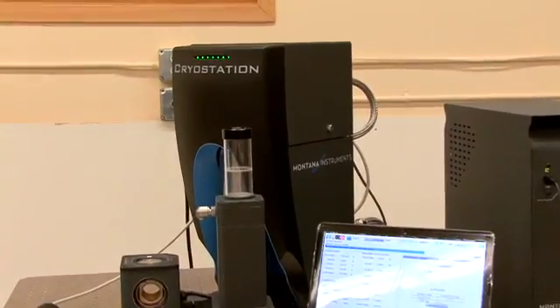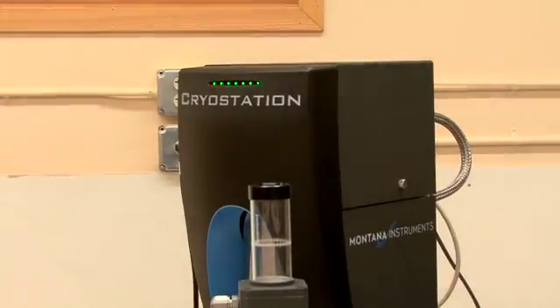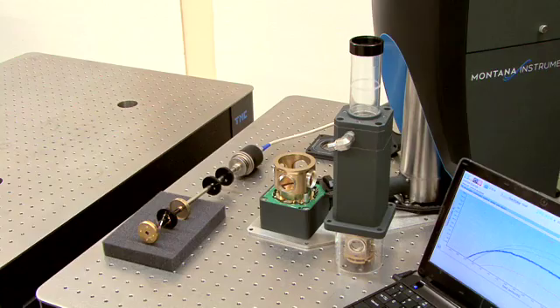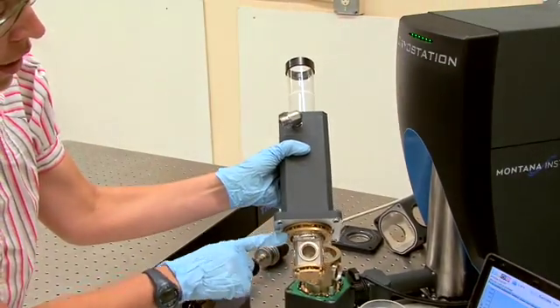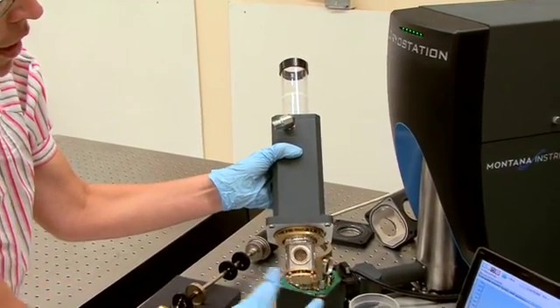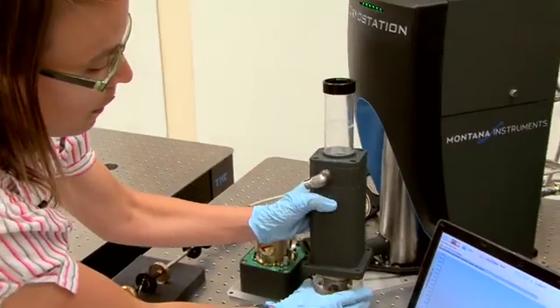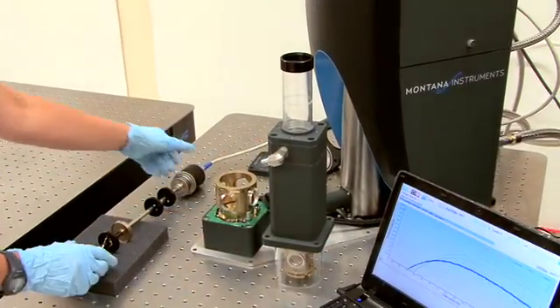The concept is fairly simple. Start with a basic cryo station. The major components of the sample and gas system are the radiation shield, the first stage link, the second stage link, the sample chamber, and the sample rod.